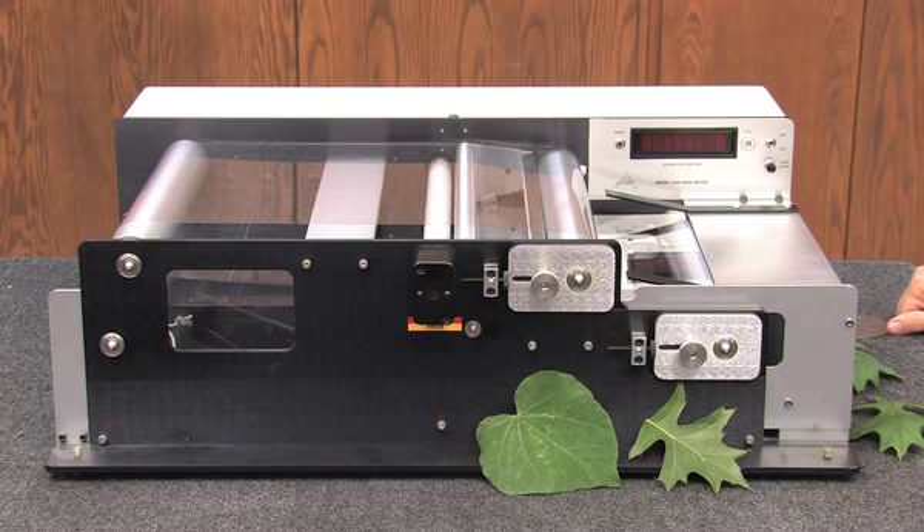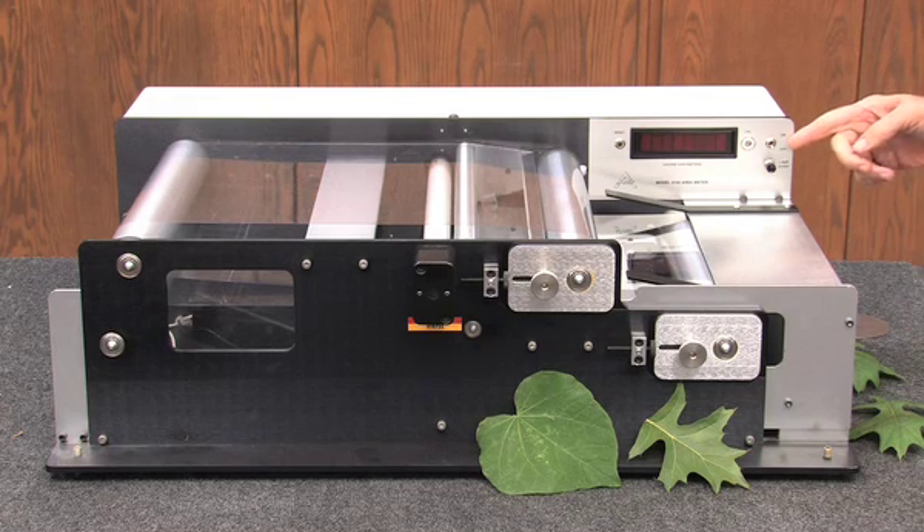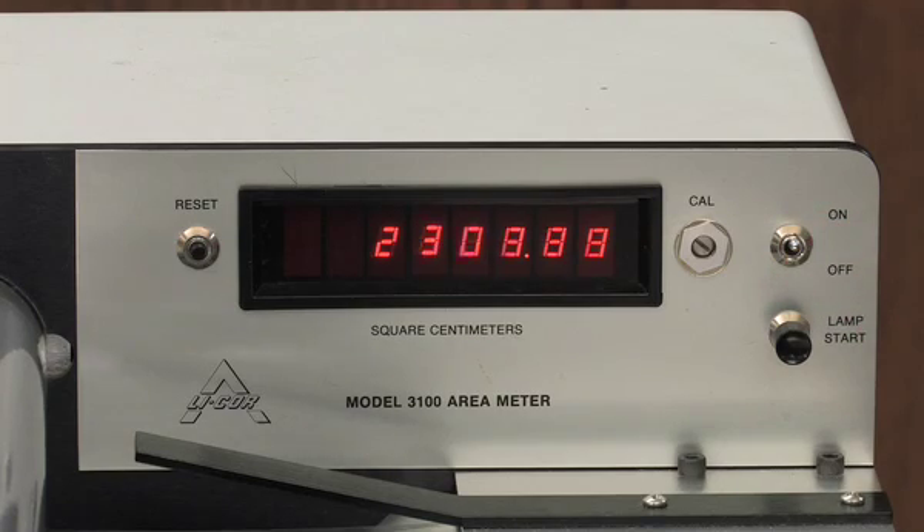This is the LI-COR 3100 area meter for measuring the area of leaf blades. To turn on the meter, flip up the toggle switch in the upper right of the control panel.